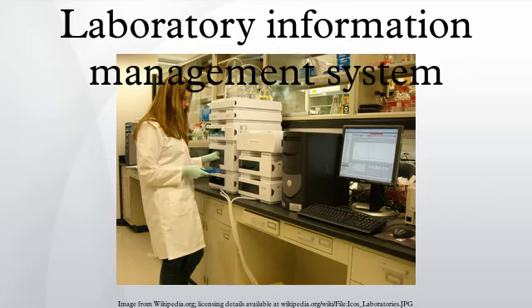Technology, operations. The LIMS is an evolving concept, with new features and functionality being added often. As laboratory demands change and technological progress continues, the functions of a LIMS will likely also change. Despite these changes, a LIMS tends to have a base set of functionality that defines it.